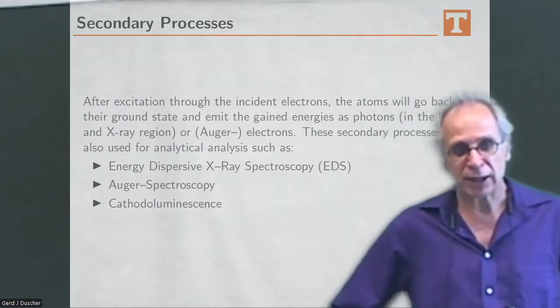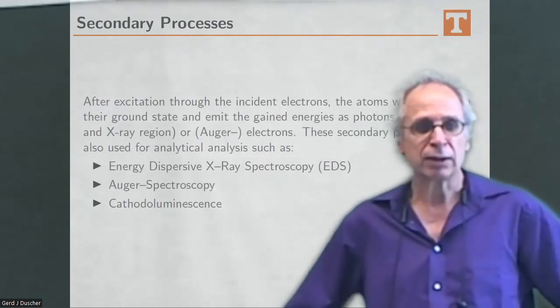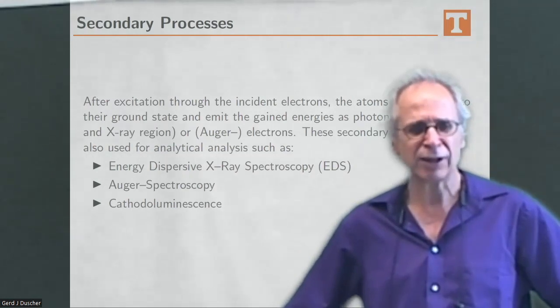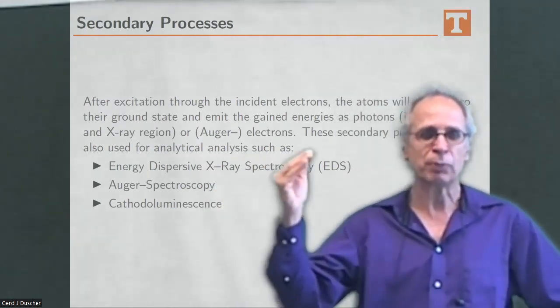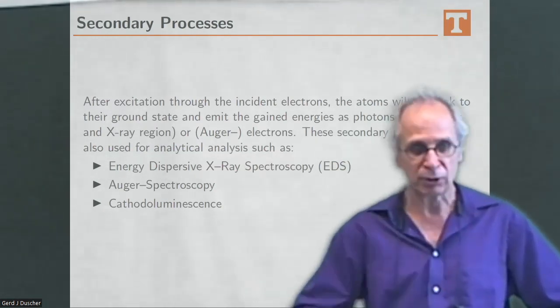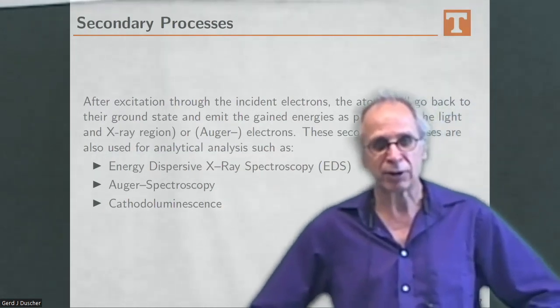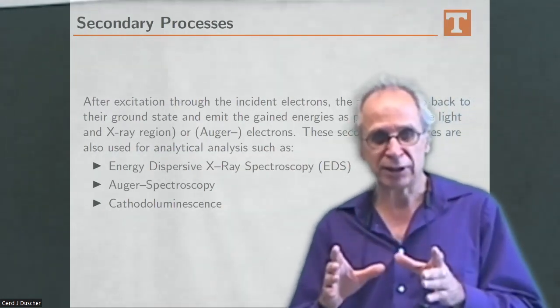The average time difference when an electron hits the sample is actually larger than how long this excitation lasts, and the atoms go back to the ground state for most materials. So you can expect that your electron always sees a sample in ground state, right?